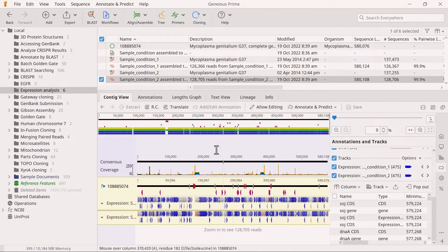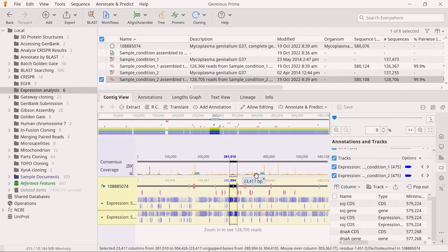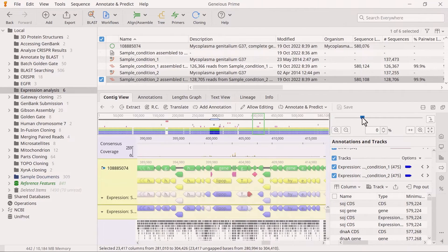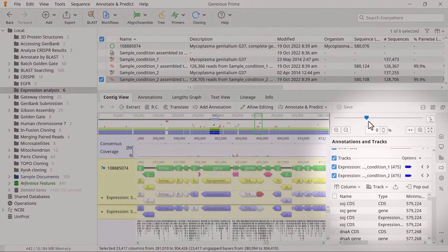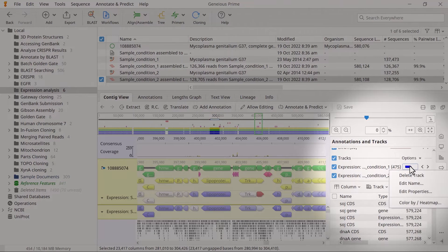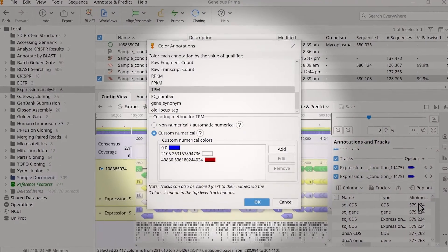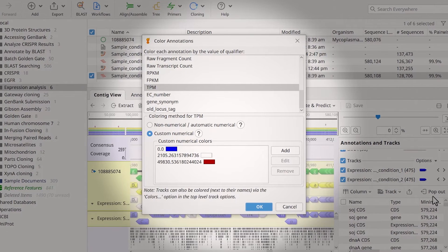By default, expression annotations are coloured based on the TPM property. They range from blue for zero, white for the mean TPM, and red for the highest TPM for any gene in the sample. Select the down arrow next to the annotation track name to colour by a different property and choose colour by heatmap. Here you can choose a different colouring method, such as RPKM or FPKM.